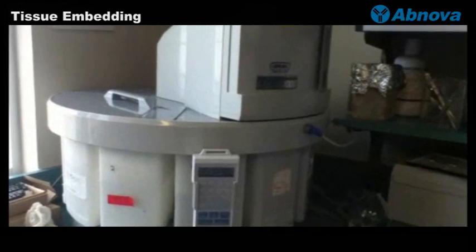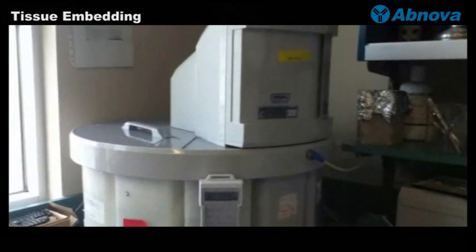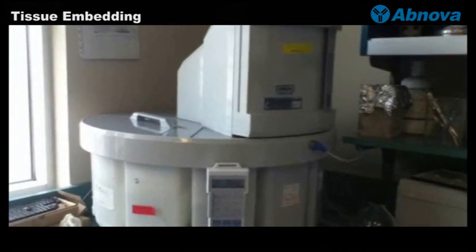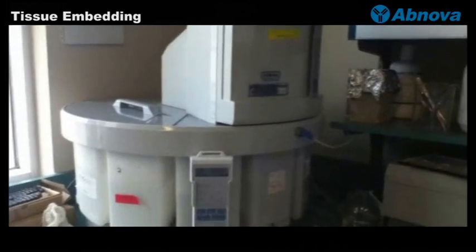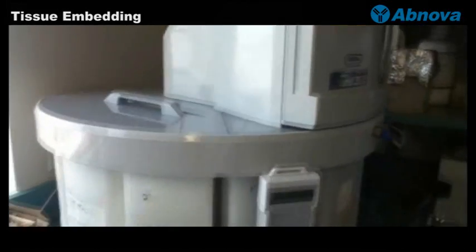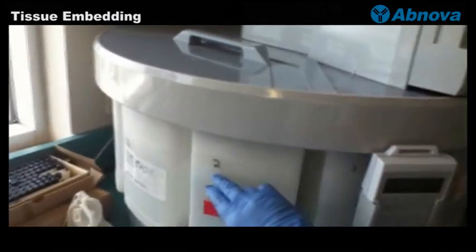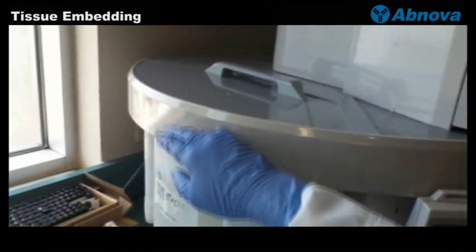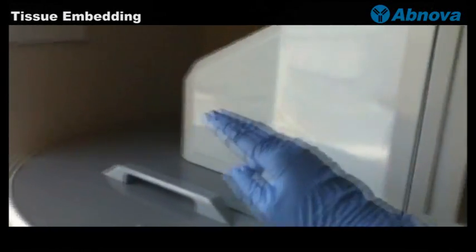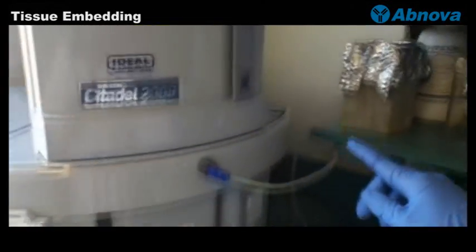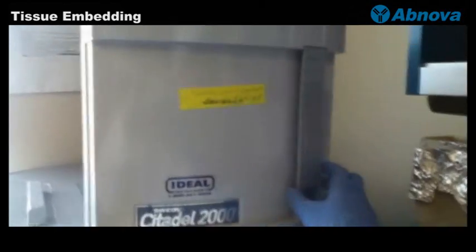Before we start the tissue embedding, the tissue has to be processed through this automated processing machine that has multiple stages like PBS, 50% ethanol, and then a gradual increase to 100%, and then xylene, all the way to paraffin.